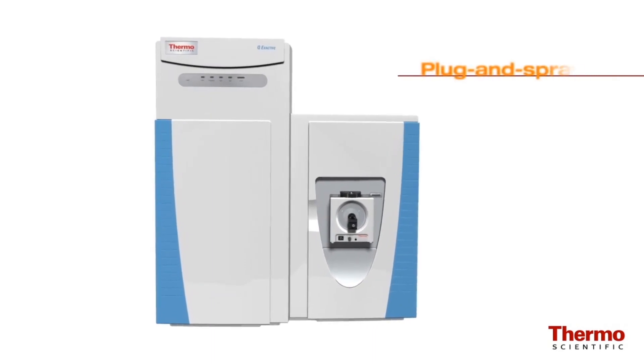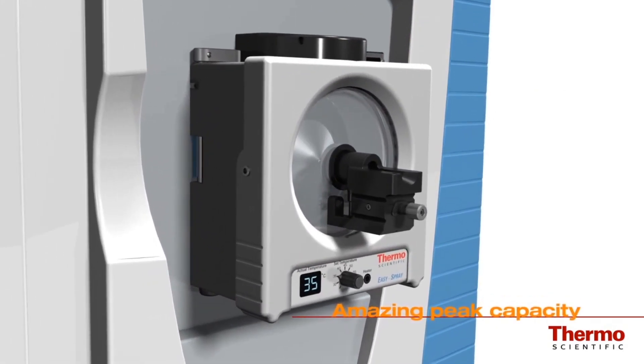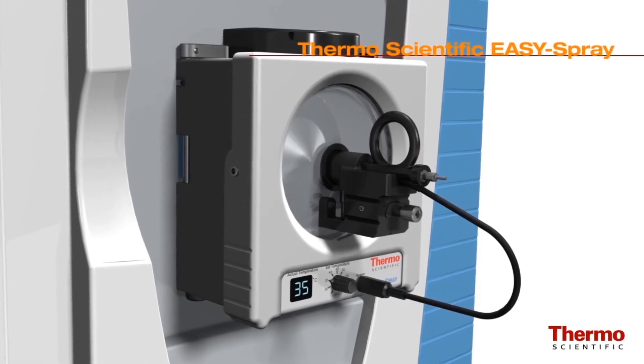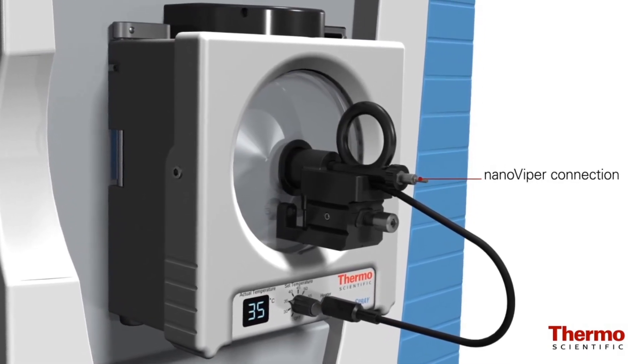Thermo Fisher Scientific's Easy Spray Nano Electro Spray Ion Source, a 2013 R&D 100 award winner, addresses this through the use of specifically designed devices in which the separation column, heater, high voltage electrode, and emitter are integrated in a ready-made assembly.